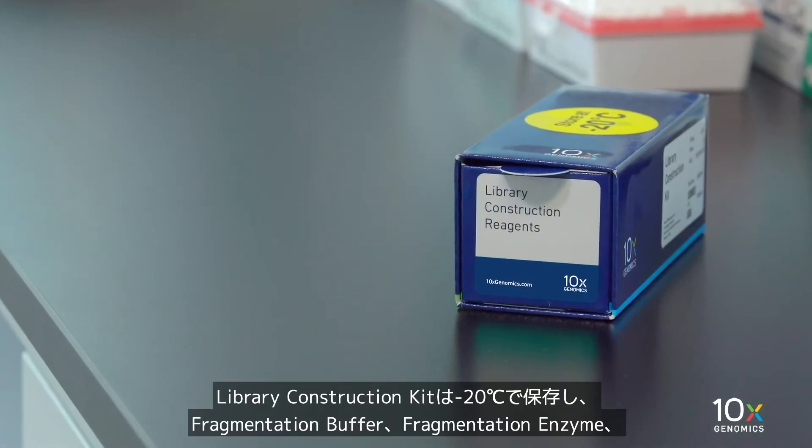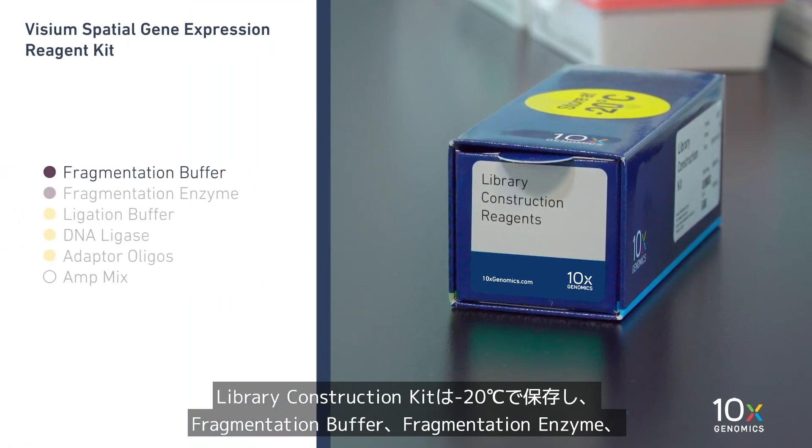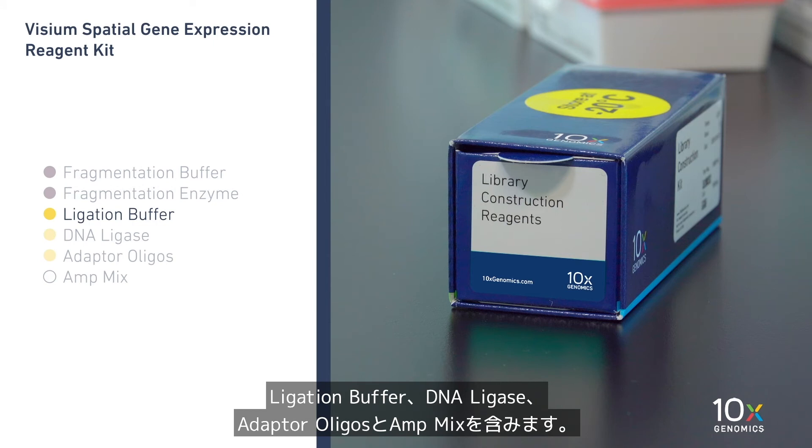The Library Construction Kit is stored at minus 20 degrees Celsius and contains Fragmentation Buffer, Fragmentation Enzyme, Ligation Buffer, DNA Ligase, Adapter Oligos, and Amp Mix.